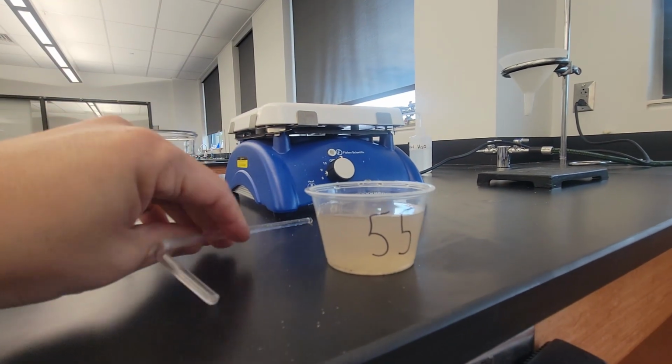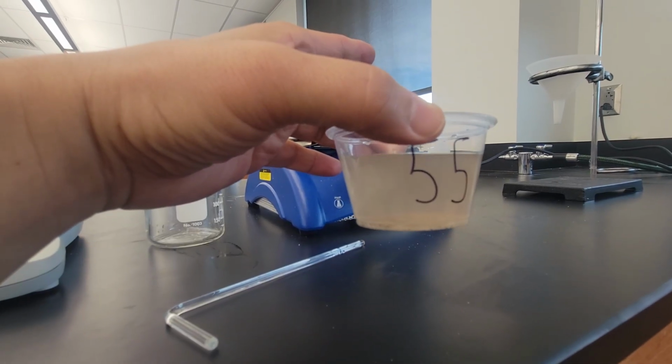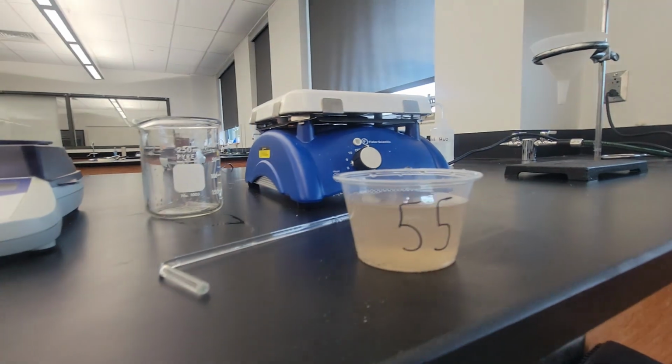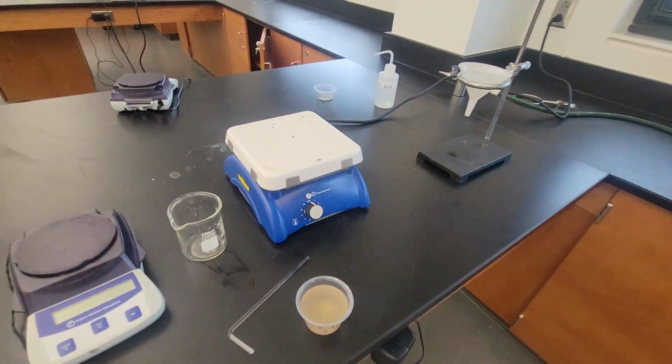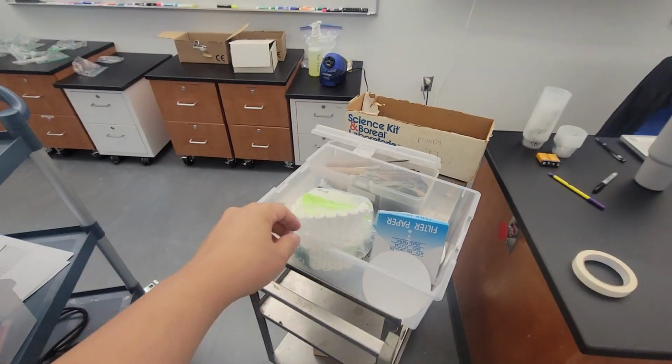Next, now we have salt, water, and sand, liquid and a solid. How do we separate liquid from solid, or solid from liquid? That's right, filter. Let's grab a coffee filter.